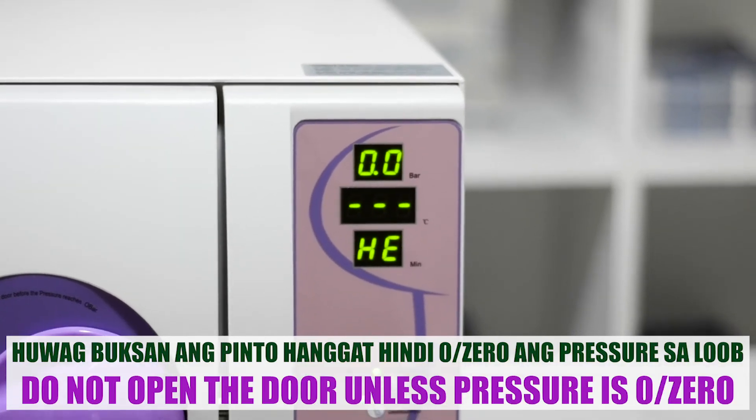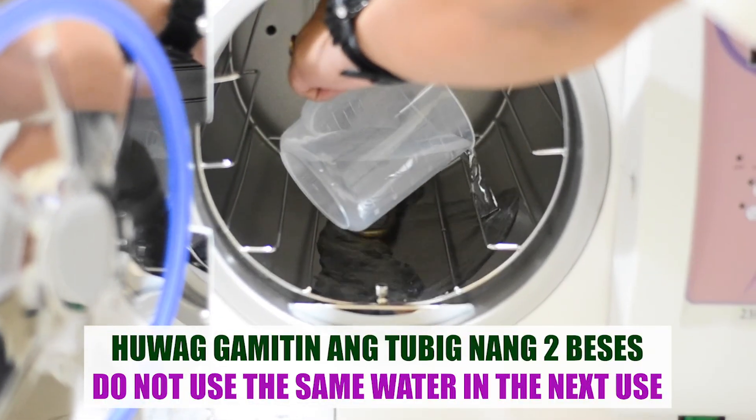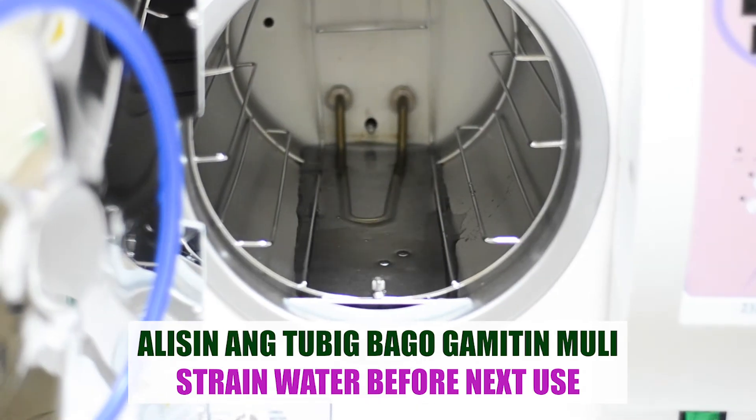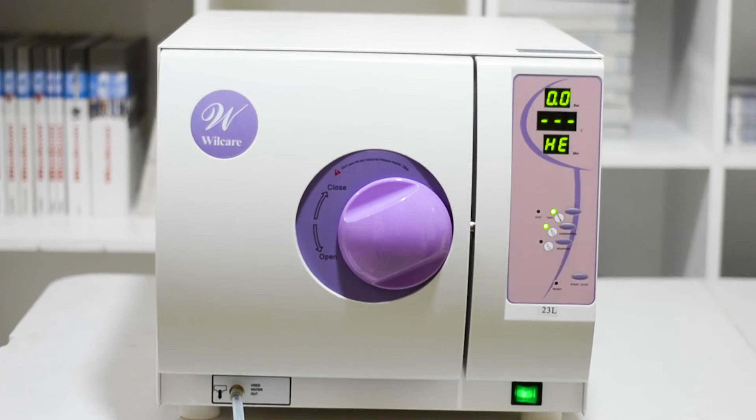Do not open the door unless the pressure is at 0. You cannot use the same water again after one cycle — please drain the water before next use. And that is how to use the autoclave steam sterilizer.